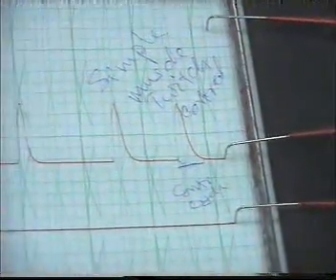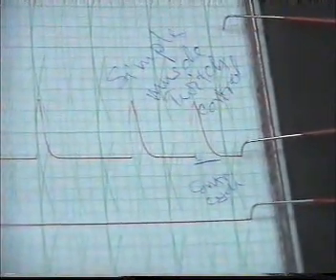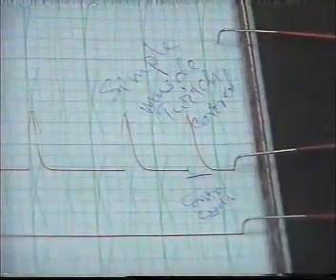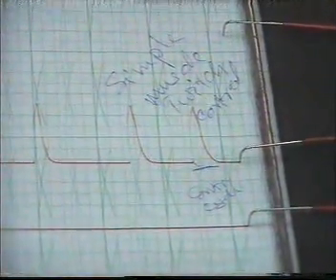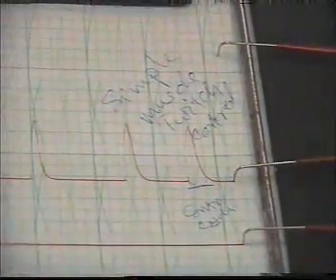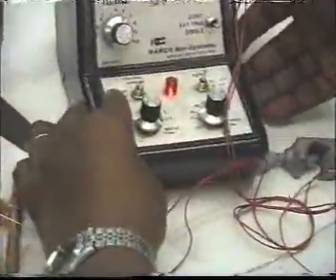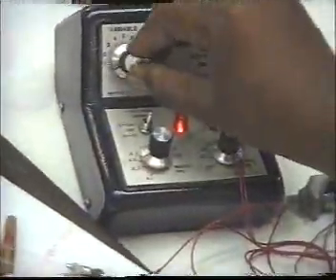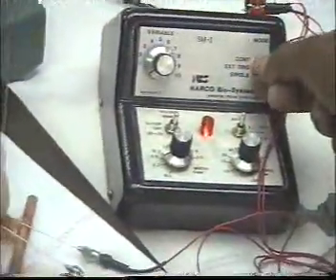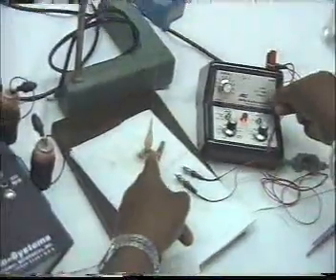يمكن أيضا أن نوضح تأثير زيادة التنبيه على انقباض العضلة. فنبدأ بالتنبيه، نغير المنبه إلى درجة الفولتج هنا كما تشاهدون، والآن في زيرو. لذلك لما نعمل أي تنبيه ما في أي ريسبونس لأنه زيرو.